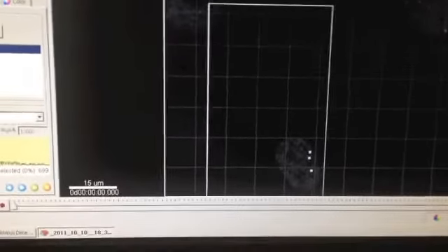Go through now. Okay, we're still getting some in the cytoplasm. There are some you can see being picked up in other cells. We'll have to go through and manually remove those. Let's try and go in there, get the focus right. Okay, so that was still a little bit too much, so we got up to 95 here.